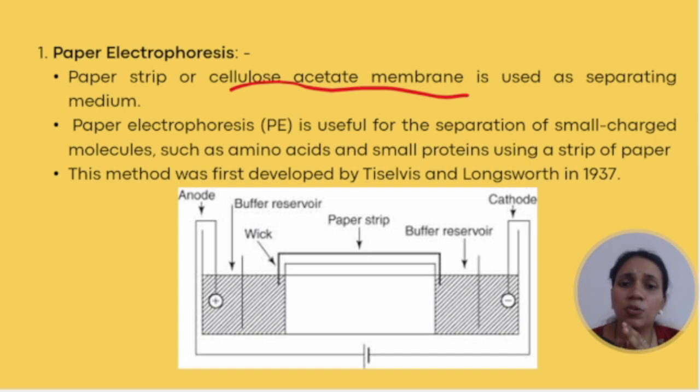Then next, what can be used for this is starch. It forms opaque gels on boiling and cooling. It is another non-absorbing medium and free of impurities. It gives better results especially for isoenzymes. But always the favorite one has been agarose, so we will see this later on. So first let us understand some of the concepts involved in paper electrophoresis.